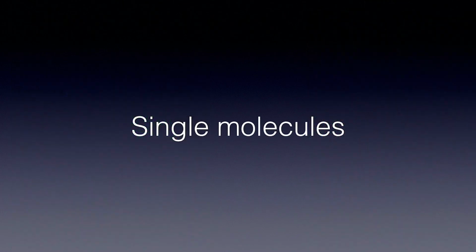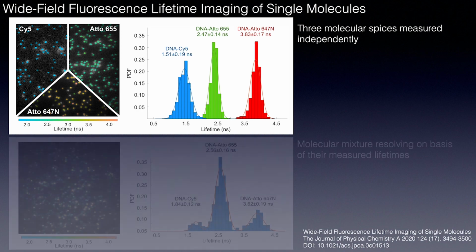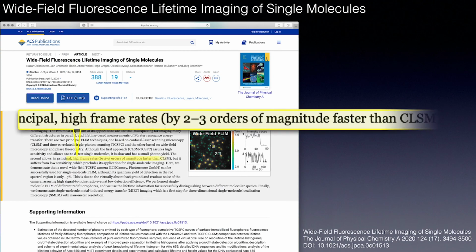One of the latest applications of the LINCam is single molecule imaging. First in this work, 3 individual species were measured: Atto 655 and Atto 647N, among them. Then they measured a sample of the mixture of all 3 dyes. As you might know, the Atto dyes used here are really close spectrally, but are easily resolvable on the basis of their lifetimes. This work was recently published, and the authors found a boost of 2 to 3 orders of magnitude in the acquisition performance.